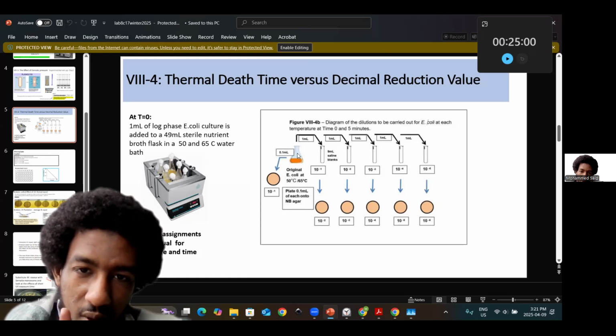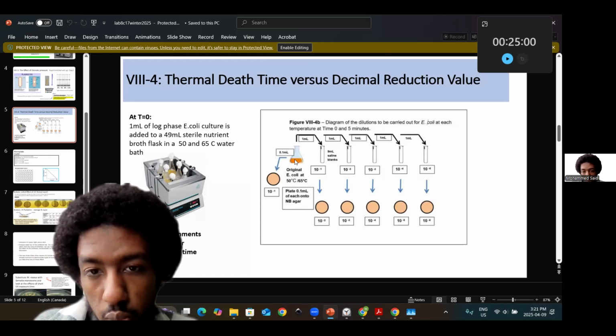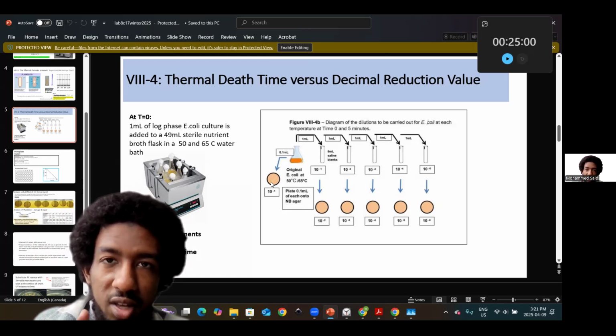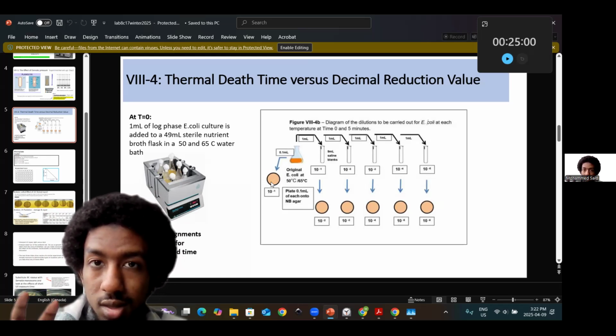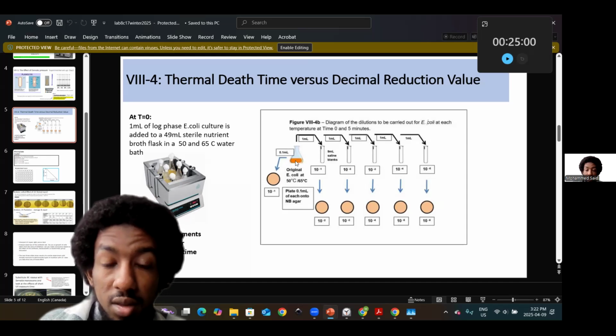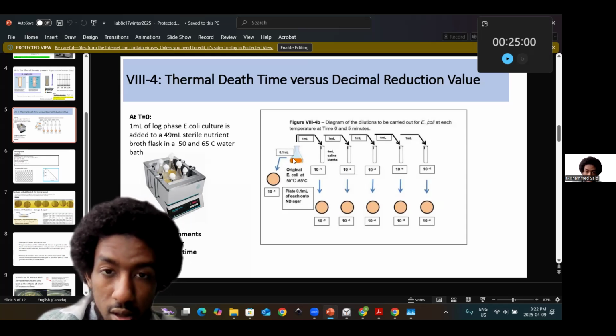Actually, another point, two separate points, but one is that you would have also done this directly with 0.1 mils added into the 10 to the minus 1 plate that's shown on the left-hand side. The benefit of this is also to ensure that you have a stock, kind of like a stock plate. Even though it's 10 to the minus 1, in this semi-control, if you find no bacterial growth, then it's possible that no bacteria was inoculated into the stock itself, i.e. there's no bacteria here, or when you actually did the pipette, you didn't add in bacteria. Second option, that's the second point, right?